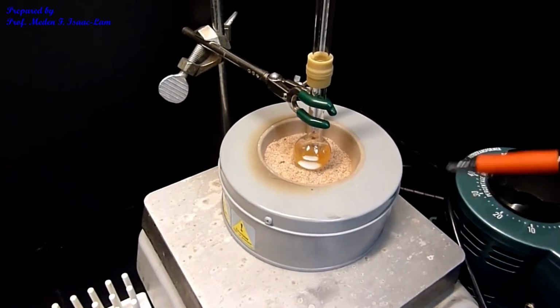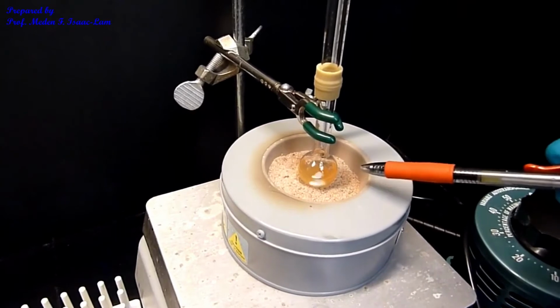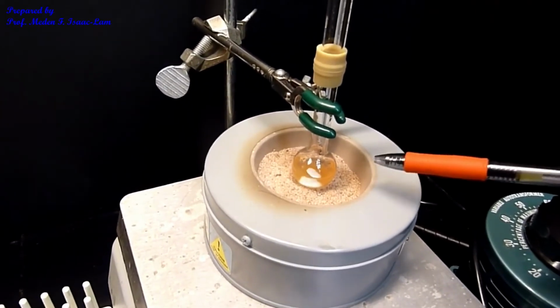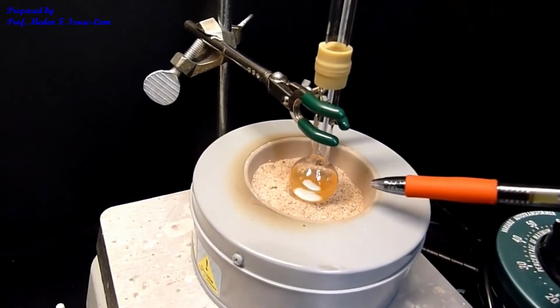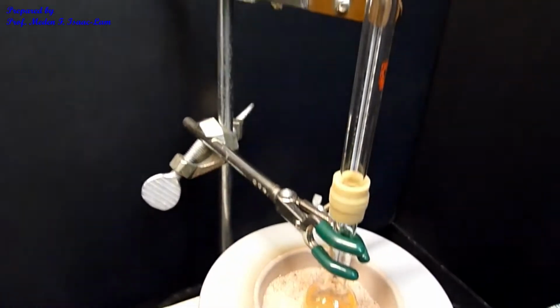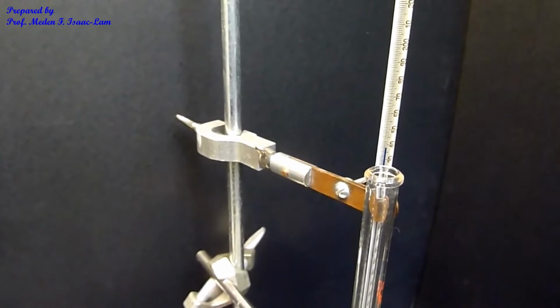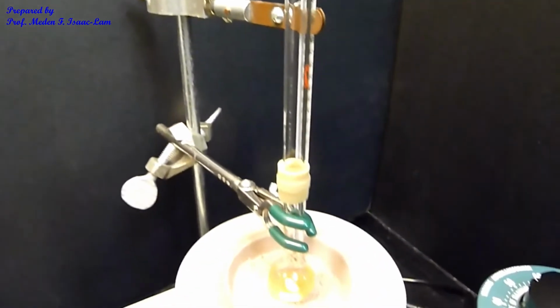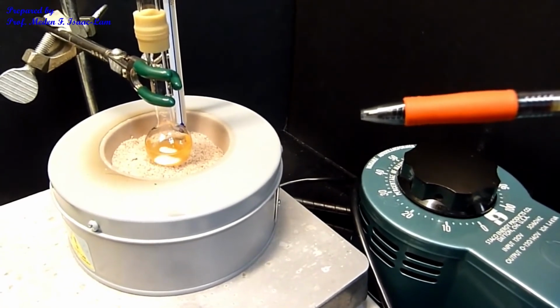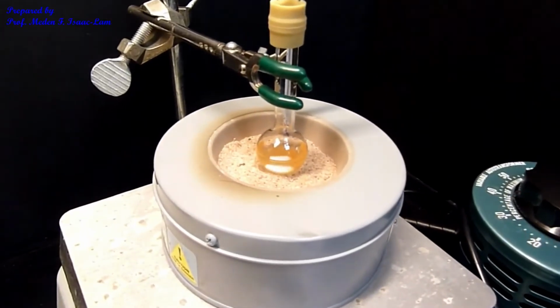So right now I'm stirring it, and I have the solution in here. Again, it's just three components: the unknown alcohol that I added, the acetic acid, and then the DOWEX. And right now the temperature is about 138, and I set the transformer to 55. So we're going to time it now for 20 minutes of refluxing. So basically we are boiling the solution so that we make the ester.